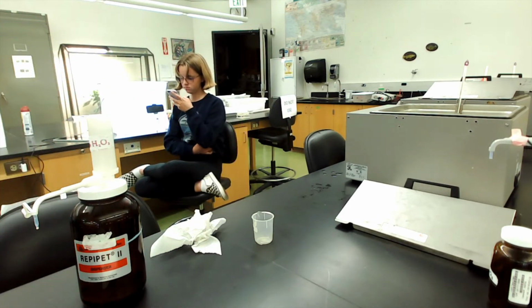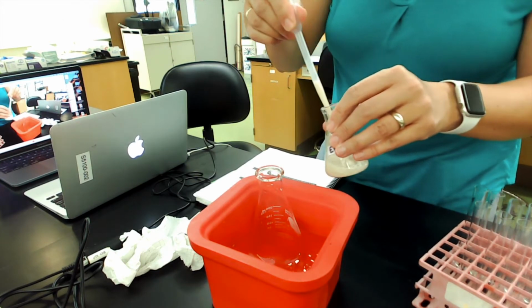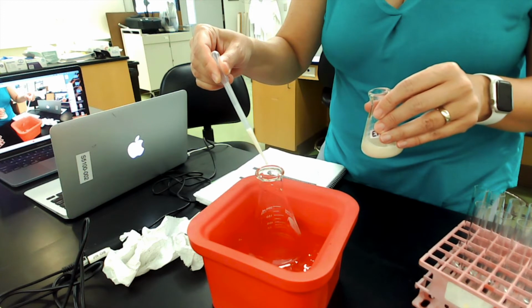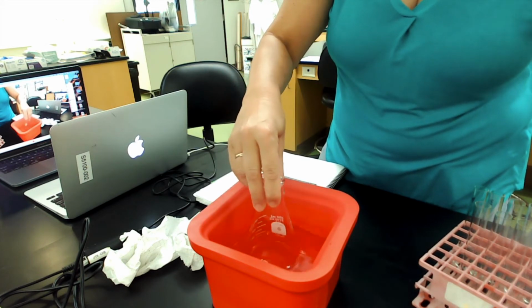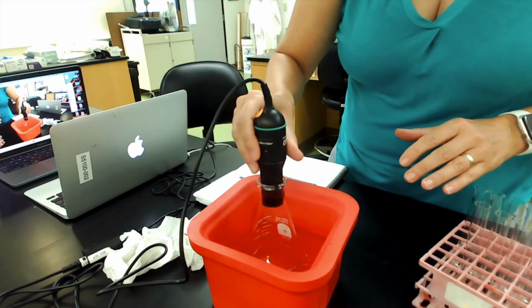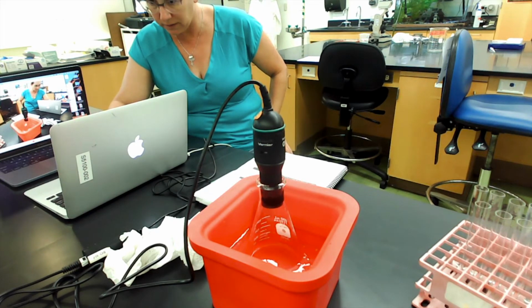Then I bring it back over here, and I'm going to add my 10 drops of enzyme. 1, 2, 3, 4, 5, 6, 7, 10. I'm going to do the swirl. I'm going to leave it in the ice bath, put in my little meter, and then come over here and hit run on the computer.